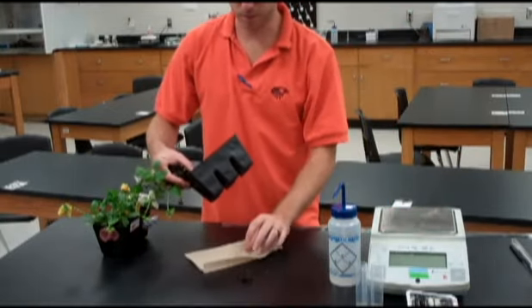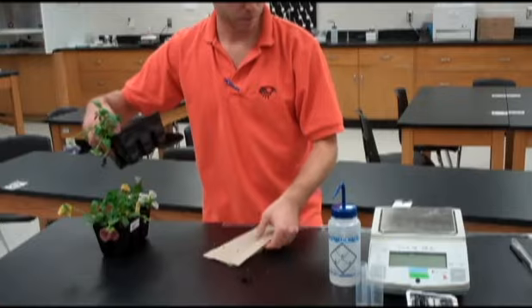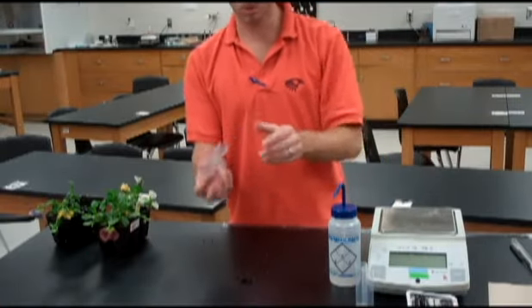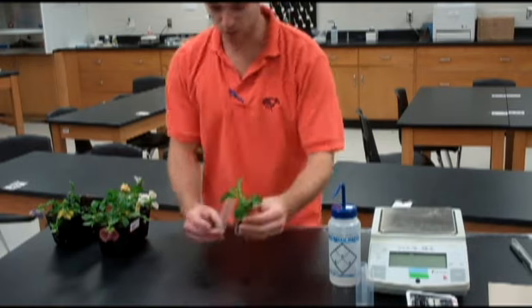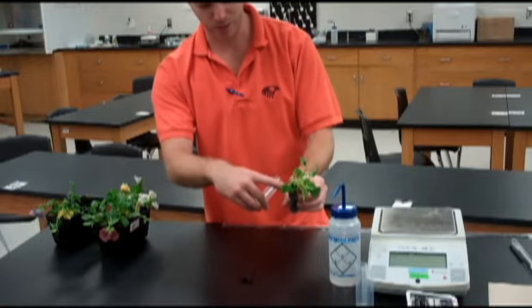Make sure you put down some paper towels so that when you get it out, you can clean off all the roots and get all the extra dirt put off to one side. You can save it because it's great dirt. Get all that dirt cleaned off and you're going to put the plant into one of these clear tubes. Make sure to fill in the bottom with some of that extra dirt so you have the entire tube full, but not packed, with your plant sitting on top.